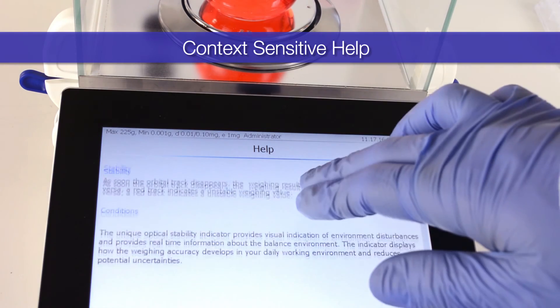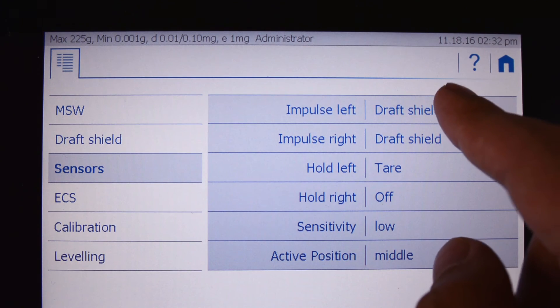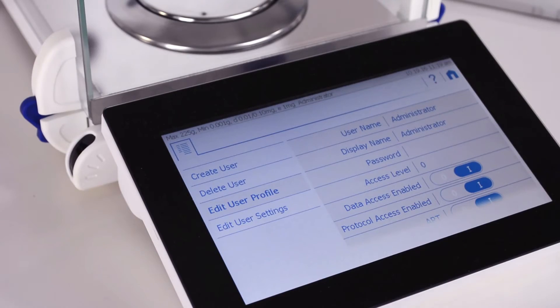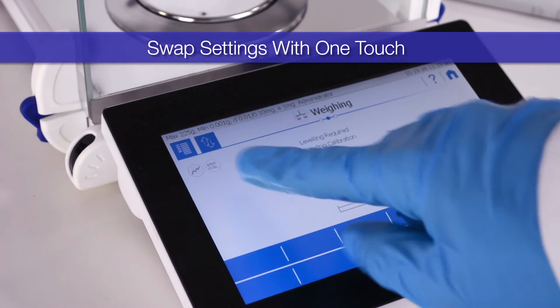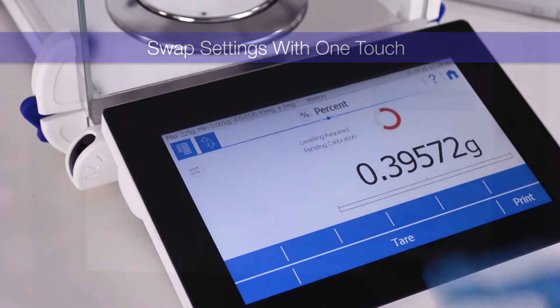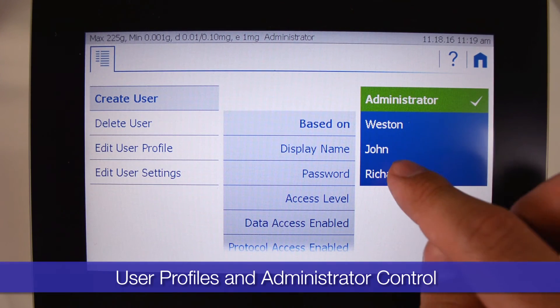With the amount of customization and settings that can be changed, it would be the ultimate convenience to be able to swap between different sets of settings that you've spent time fine-tuning. The H series allows just that. The balance supports the creation of user profiles.